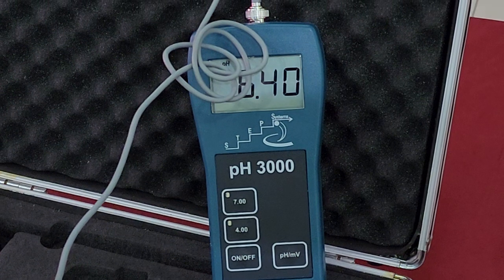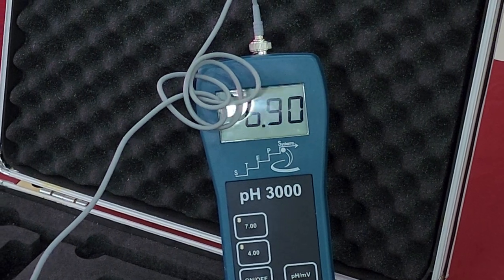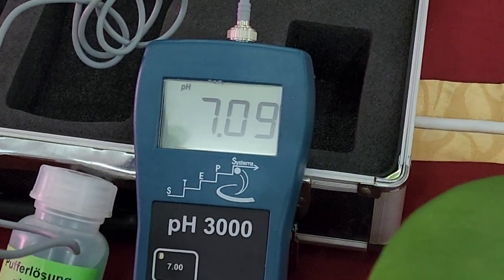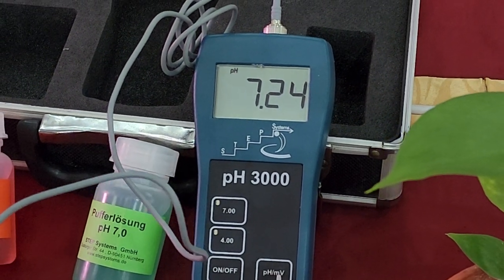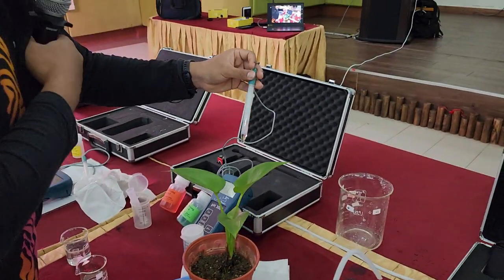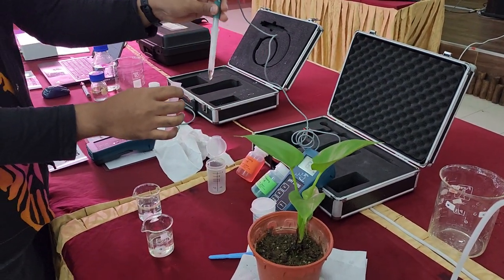I think this is the pond water because it looks yellower. Interesting. The pond water is actually more alkaline. Why is that? Why do you think it is? 7.2, 7.3 is actually the pH of your blood. Why do you think that's the case? Okay. Let's do it in here.